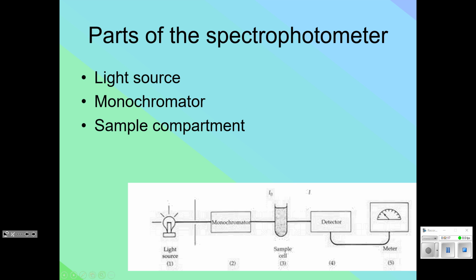All right, so our spectrophotometer. Again, it doesn't look like it has a lot to it, because if you look at it itself, there is one button on it, right here. And that's basically the same as your tare or zero button on a scale. There's a dial on it, which we'll talk about in a minute, but then there's a place where you put your solution, and that's it. However, again, first off, it has a very powerful bulb in it.